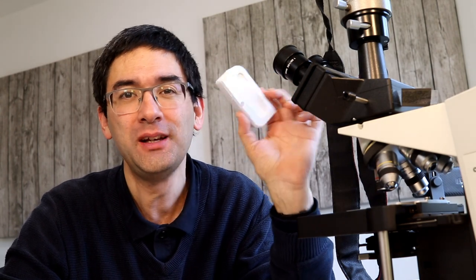So hi, MicrobeHunter here again, and in this video I'm going to do two things. First of all, I want to show you what's in this little box. It's a micrometer slide. It's used to make measurements under the microscope.